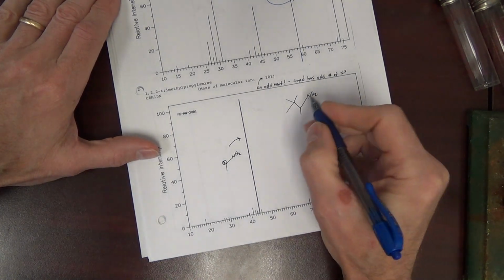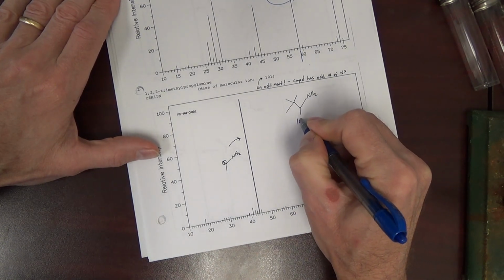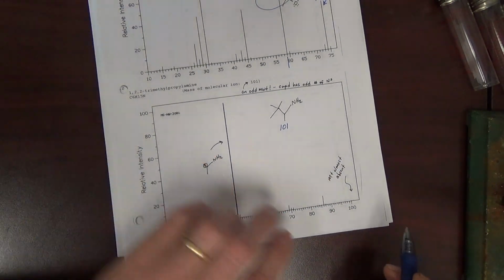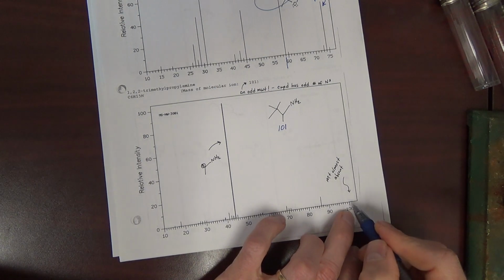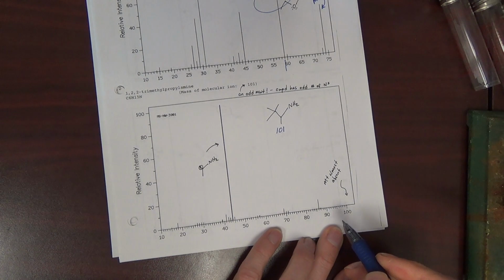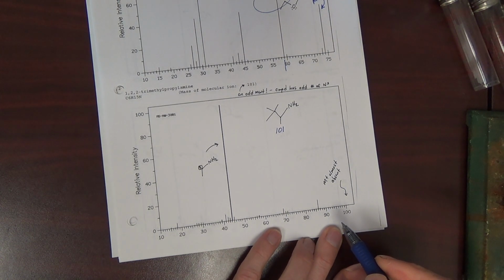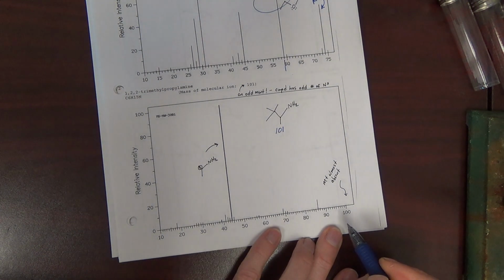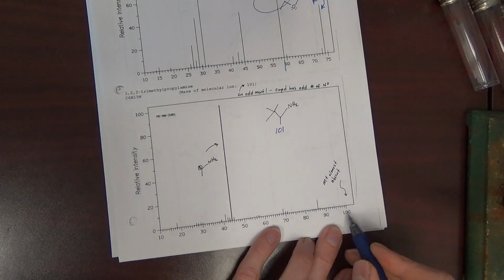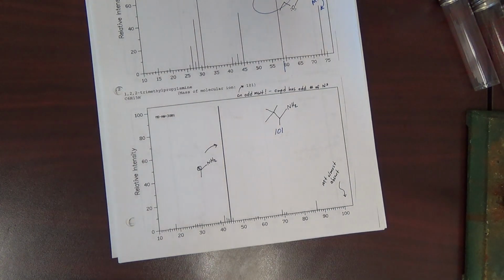Okay, you add this up, the mass of this is 101. Do we have a 101 in the mass spec? It's possibly there, it's mostly absent. That means that the compound did not survive long enough to hit the detector.